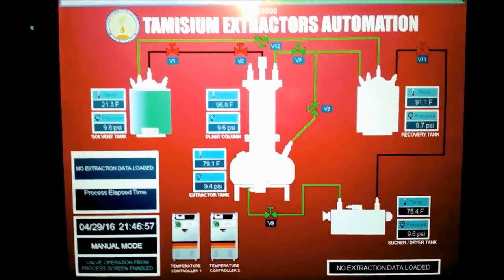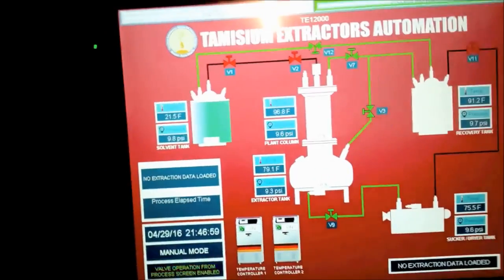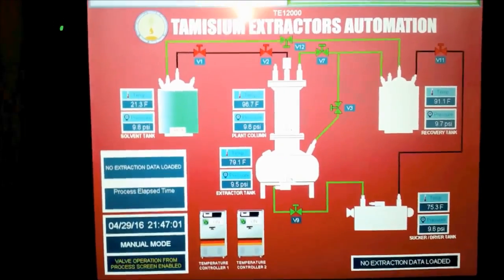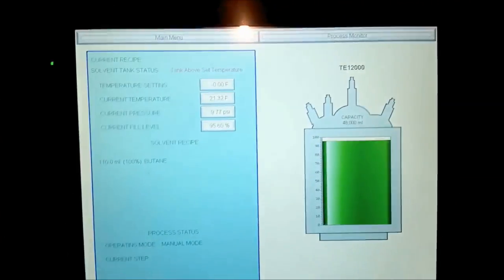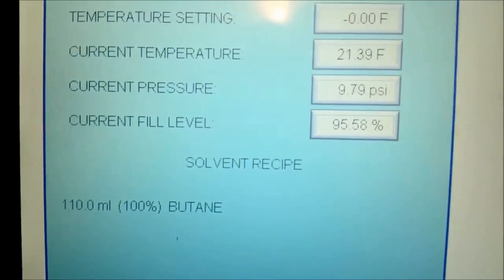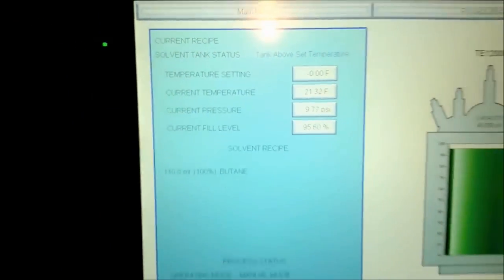Right now the system is recovering the vapor pressure from all of the tanks back into the recovery tank. Because the day is finished, it's climbing at 95.58 percent.